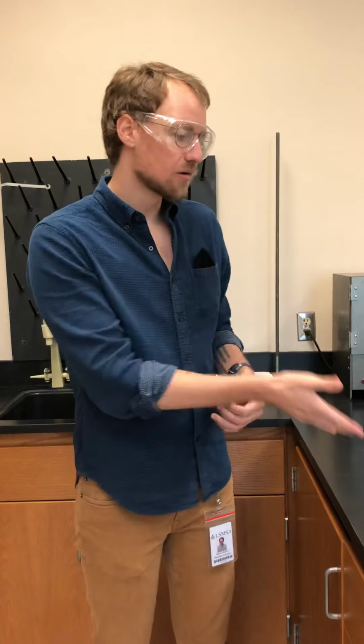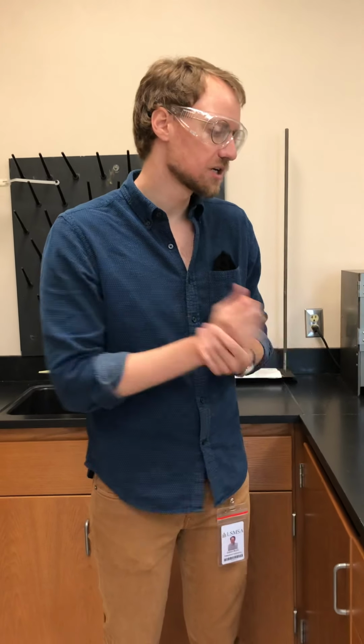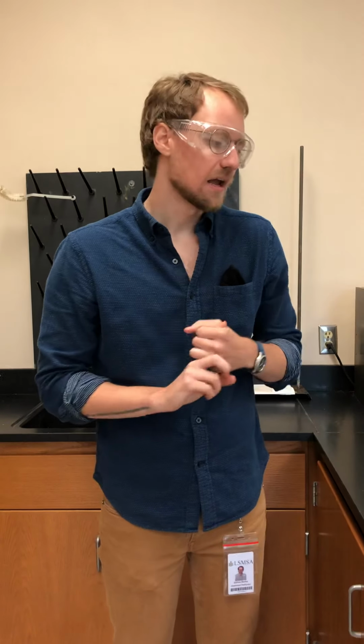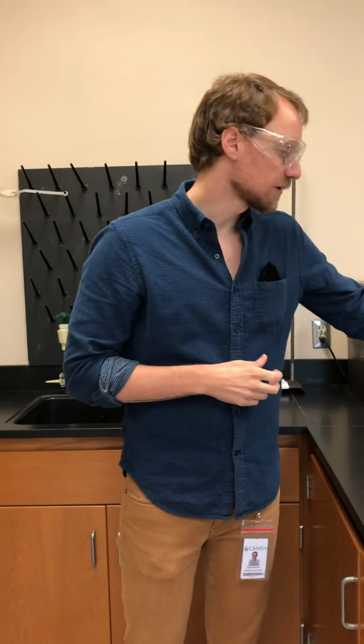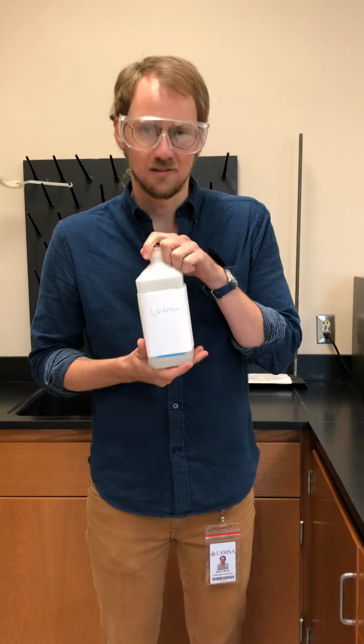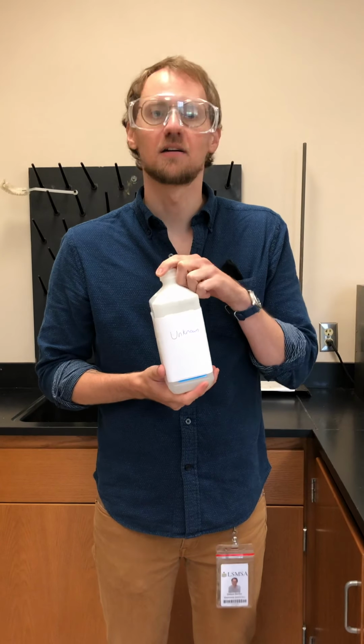All right, so that's our unknown solution and measuring the mass and volume. You'll calculate the density and then use the table of known values to compare your calculated value with those to determine what the substance is that is inside this bottle. All right, next we're going to be calculating the density of some solids.